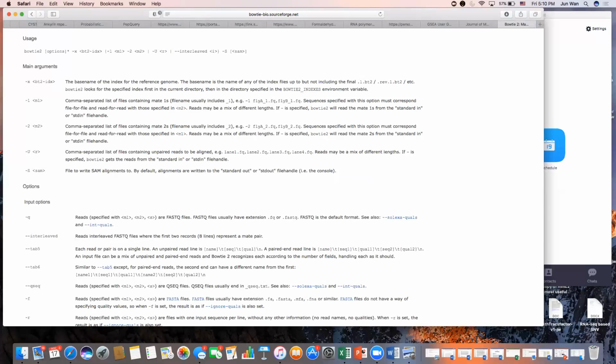Now, the convenient part for you is it's loaded into Karst already. So all you have to do to find it is type module space av, pull up the list of the modules that are available in Karst, go to the Karst Life Sciences section, and you'll find Bowtie 2/2.1.0. That's their default version of Bowtie 2. It works really well, and it's really fast. Module load that, okay? Now you've got your FASTQs. Now you've got your program loaded into Karst. So when you type bowtie2, that tells it what program you're going to start with.